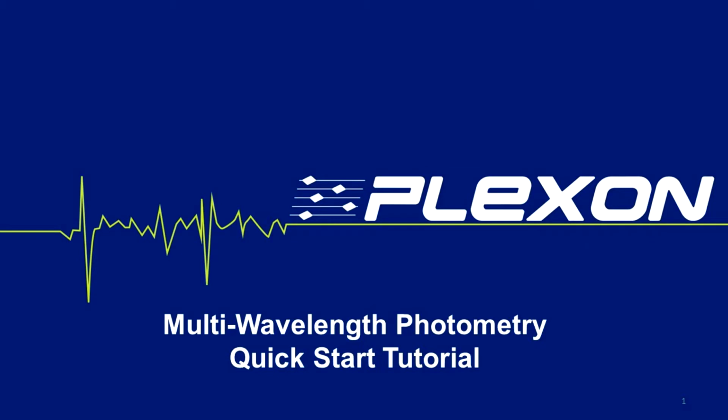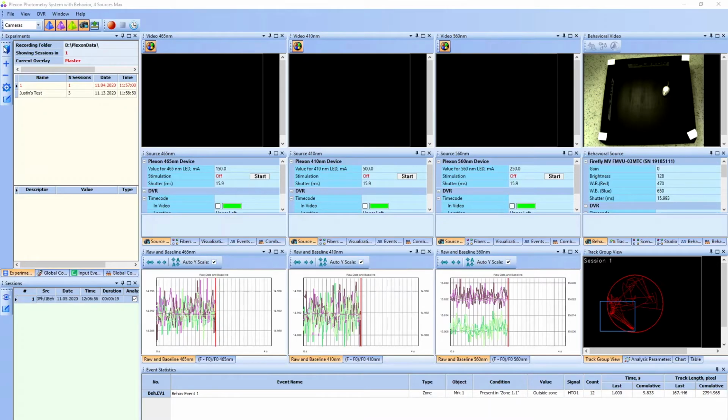Welcome to the Multi-Wavelength Photometry Quick Start tutorial. Today we'll be demonstrating how to do some basic things with the Plexon Photometry software. If your photometry system is not yet set up correctly, you can refer to our hardware quick start guide located on our website, plexon.com. First, before you start recording, you will have to set the recording folder location.